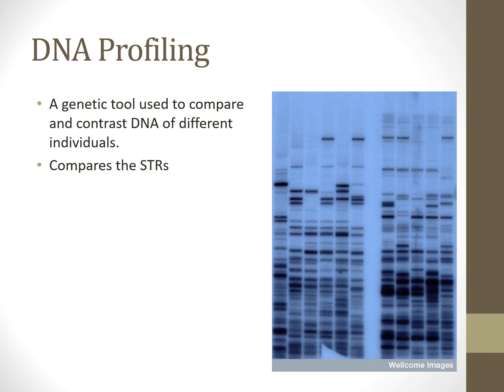So if we talk about DNA profiling now, that is when we're using gel electrophoresis to find out differences of DNA in individuals. So at that individual level, comparing those STRs.